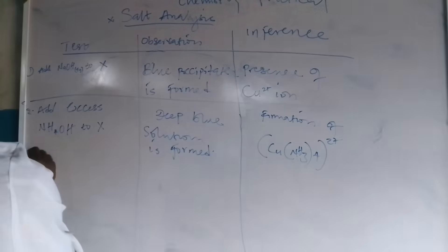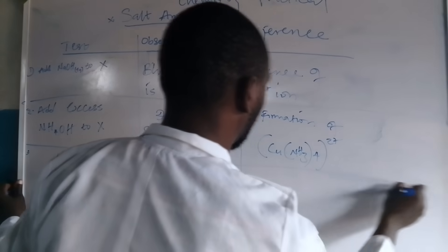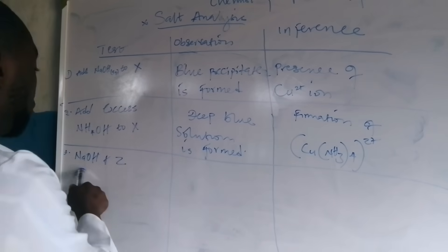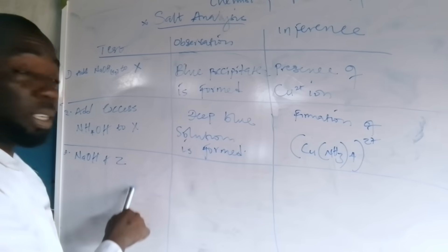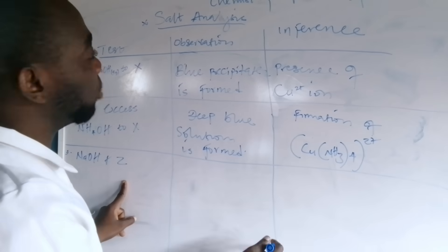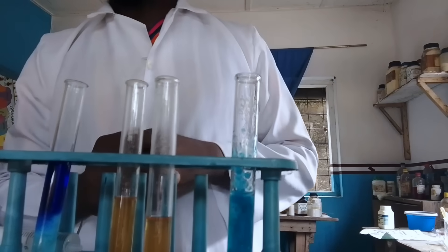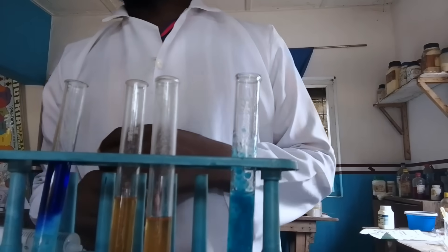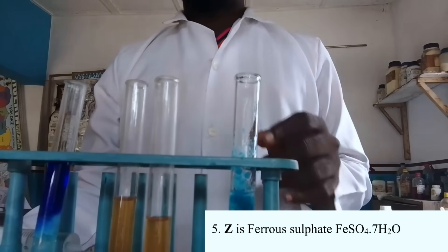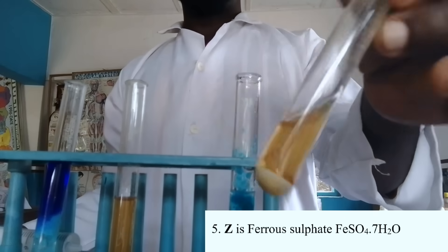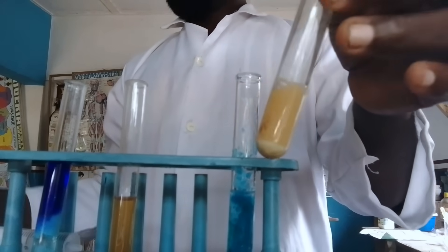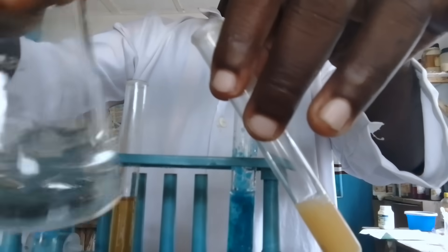Now let's go over to the third test: sodium hydroxide plus X plus Z — sodium hydroxide plus Z. We are going to be adding sodium hydroxide to iron sulfate. This is our iron sulfate, and these are our sodium hydroxide solutions.